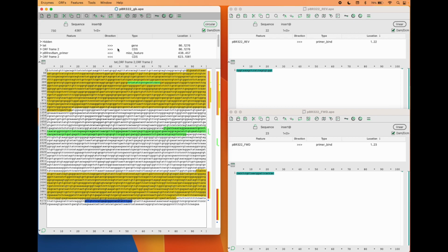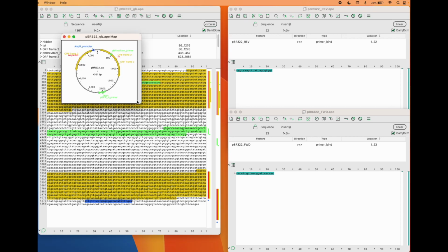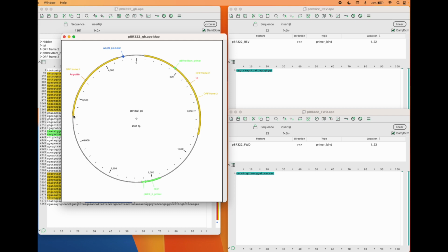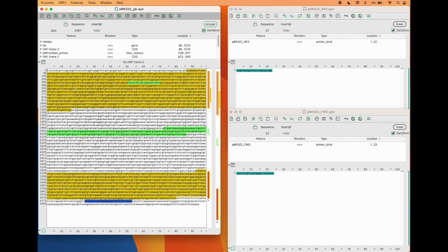All right. I'm going to click on this little plasmid symbol here and just give you a quick look. So it's a circular piece of DNA. Within the tubes in your PCR-it kit, there are going to be thousands and thousands of these little plasmids floating around. And this is what you're going to amplify DNA from. Okay, this is the template. Now we're not going to go through it today. That's for another discussion. Today we're doing the modeling, so I'm going to close this and let's look at these other sequences.